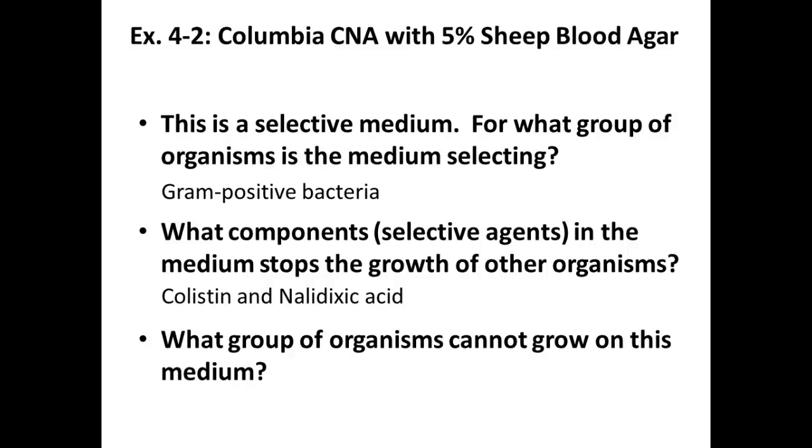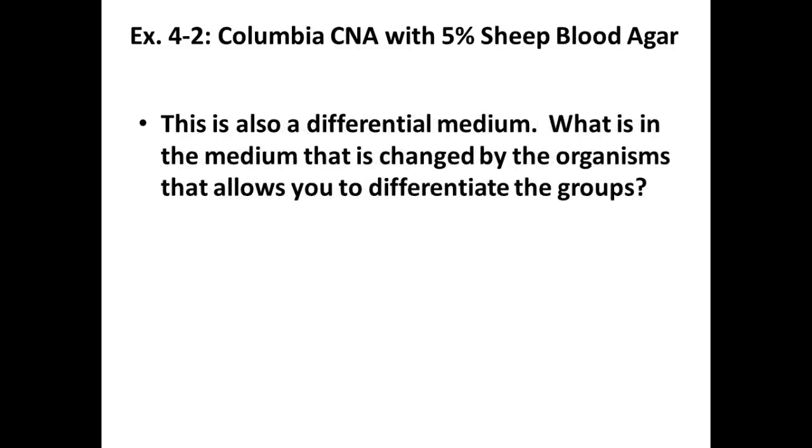So they're antibiotics, and so if gram positives are growing, who are these guys inhibiting? Who are these antibiotics inhibiting? Gram negatives. So gram negatives don't grow on these plates. And it's only because these plates have those antibiotics in it that are specific for gram positives, right? Selecting for those and killing gram negatives. So if it grows, right, if it's a gram positive, the antibiotics don't kill it, then we can ask the next question.